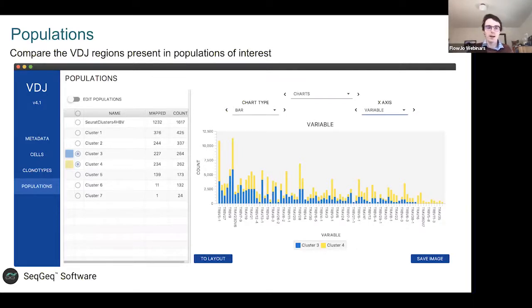Okay. I should mention, this part of it, we make all kinds of graphics. It does get kind of slow the more cells we're trying to look at, because with these populations, as we're adding hundreds of cells, that's a lot of different regions to be trying to display at the same time.